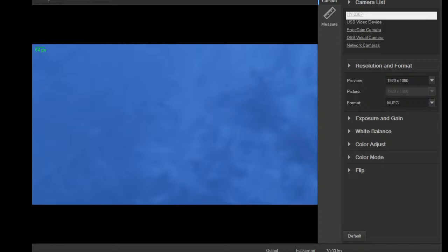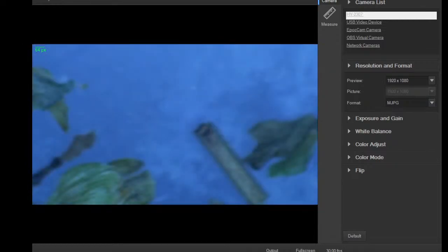Alright, a couple more fun bits. I'm going to start with the dissecting scope first, because these things are kind of big, and if they look cool, I might move them to the other one. This is herbs de Provence. The leafy little bits. It smells really good, but I forgot what's in it. I think it's like 4 or 5 different herby things.